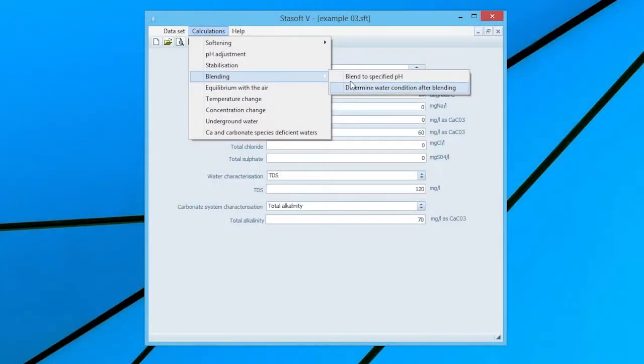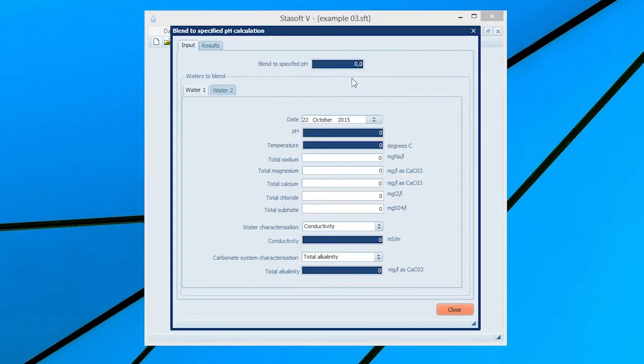Blending two waters to a specified pH. Selecting the Blend to specific pH option in the Blending menu will bring the Blend to specific pH input window onto the screen.